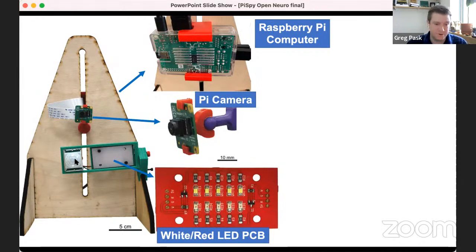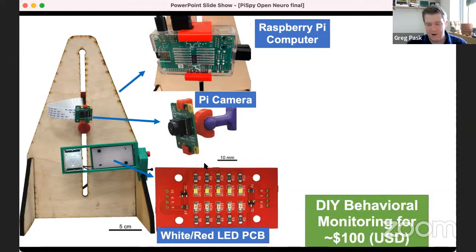There's also very commercial, accessible, easy, and inexpensive passive infrared things that Ben will talk about later. That's also depicted here. But what we really needed, and all of this came down to about $100 US. So we like that price point, and we're using the bare bones here to make it just what you would need to observe these organismal behaviors.